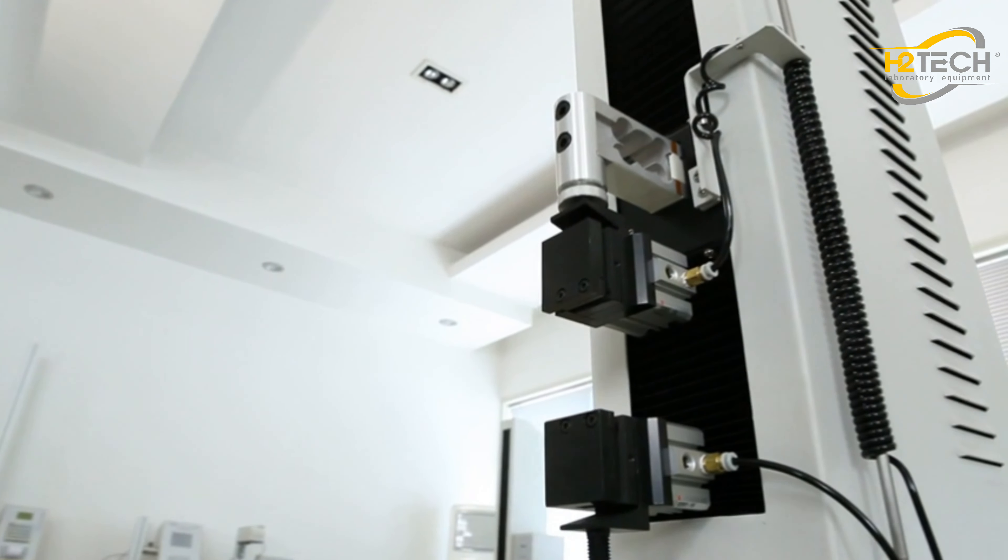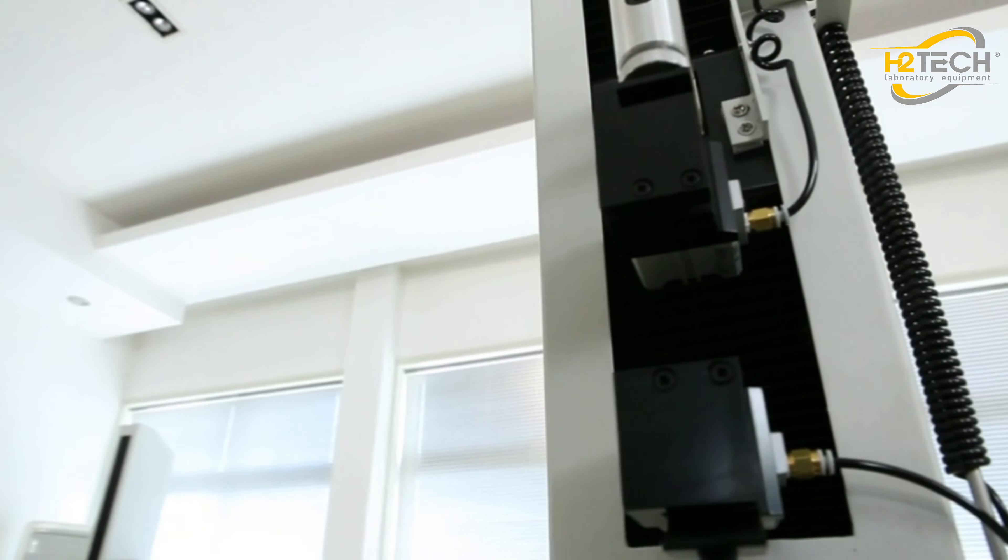The use of pneumatic clamps improves the automation of the instrument and the test efficiency, while greatly reducing the sample damages caused by manual clamping operation.